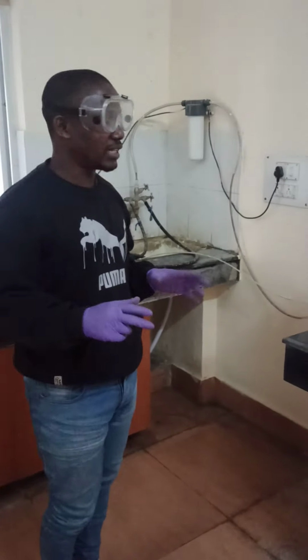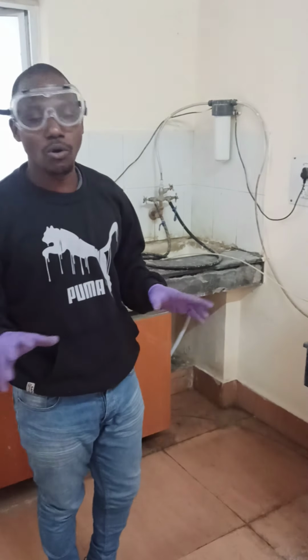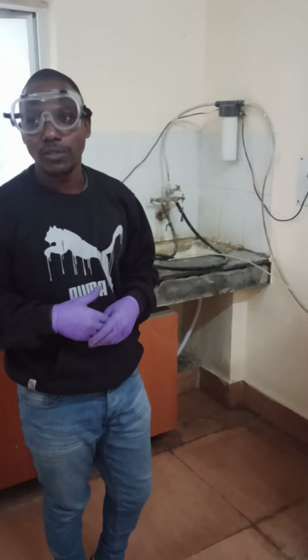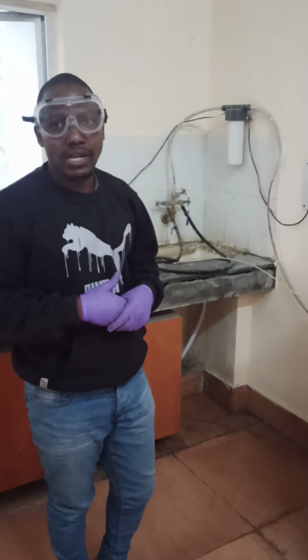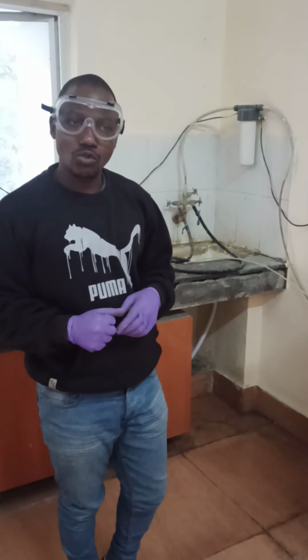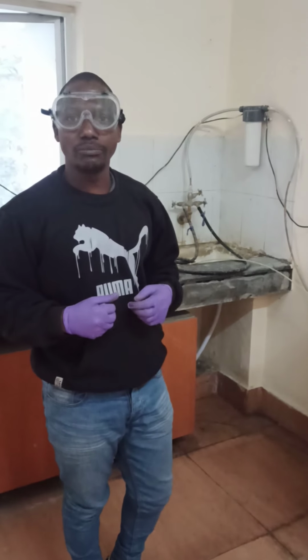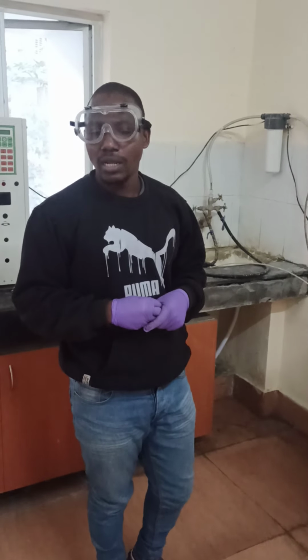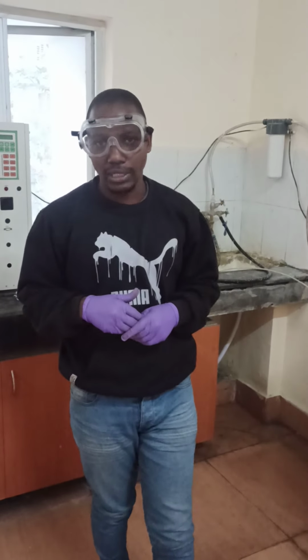I just set this up on my own. No need of having a technician to do this. It's my own work. I know it and I can perform it for you. Therefore, while we continue with this class, I'll be taking you from one instrument to another, the way it performs, how it operates, why do we do this and why not this one. But let's do it. We'll start this after the run. Thank you for today.